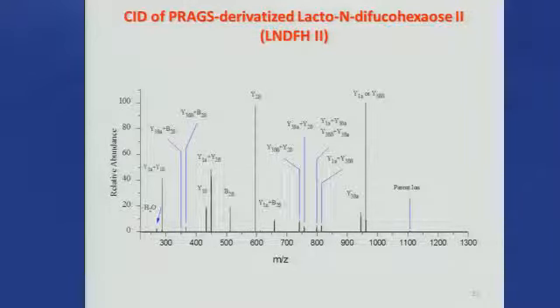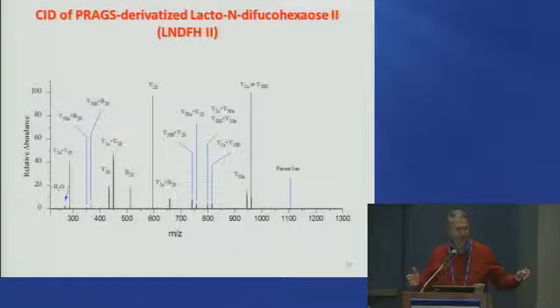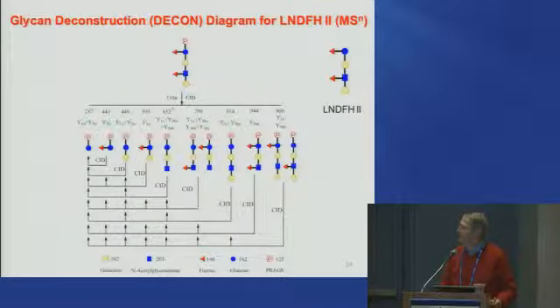So this is mainly glycosidic bond cleavages, right? But it's not a simple pattern the way the linear saccharides give a simple pattern there. It's much more complex, but you can still actually analyze this in terms of it's mainly glycosidic bond cleavages that have occurred. And more important, now since with the protonation reagent, that proton always stays on the reducing end of the carbohydrate. So you can do this over and over again, right?